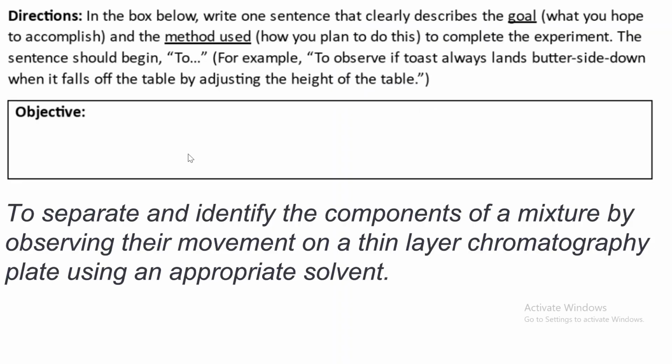Again, our objective is to separate and identify the components of a mixture by observing their movement on a thin layer chromatography plate using an appropriate solvent. So pause the video, write down the objective in your lab report.